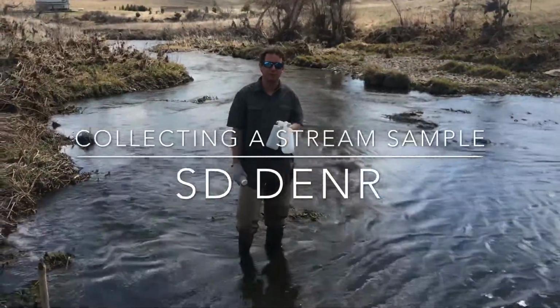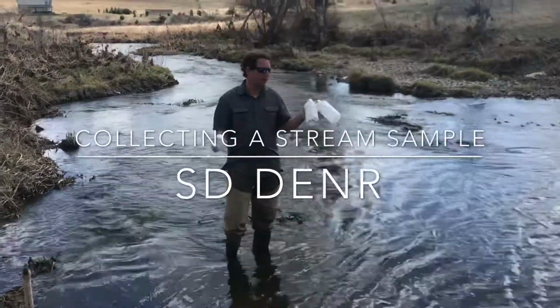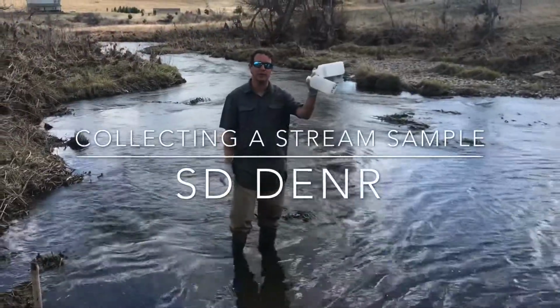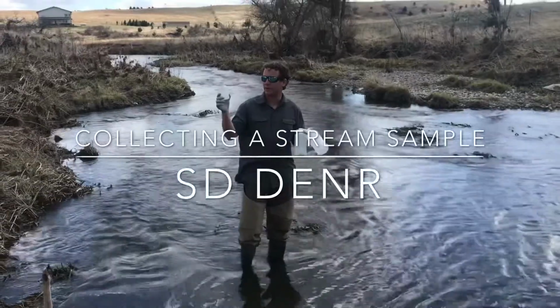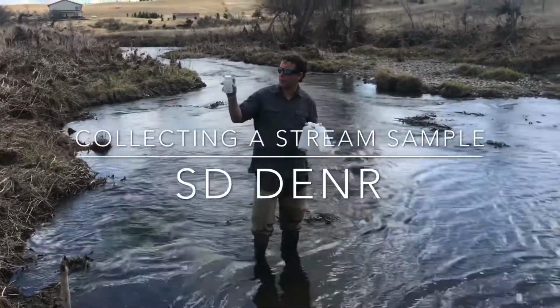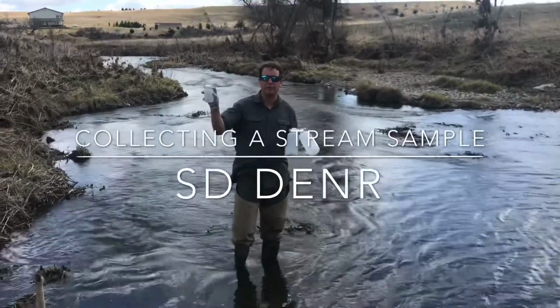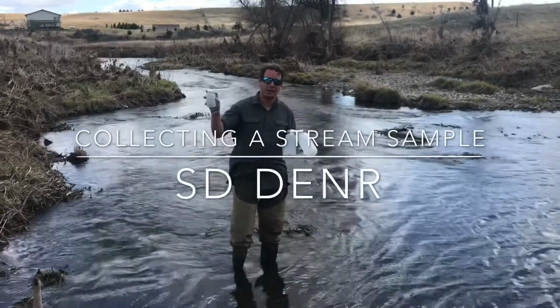So you can see here I've got my nitrile gloves on and I've got my 3 bottles. I've got the 2 1-liter Nalgenes for my A and B bottle, and I've got the 250 milliliter C bottle here. I already broke the paper seal here, but normally this seal would be attached to both the lid and the bottle to ensure that the bottle is sterile.